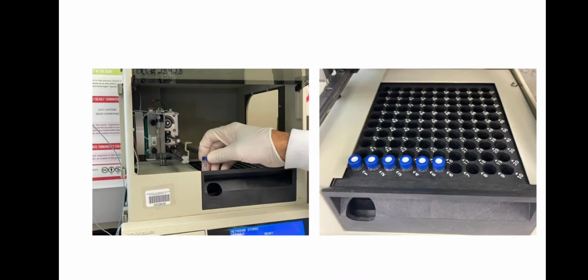Here we describe the process of running samples in the HPLC. First, load the HPLC with the autosampler vials and note the grid location of each sample vial. Create a sequence to label each sample according to its location in the autosampler, allowing your chromatograms to be labeled with the user set title.